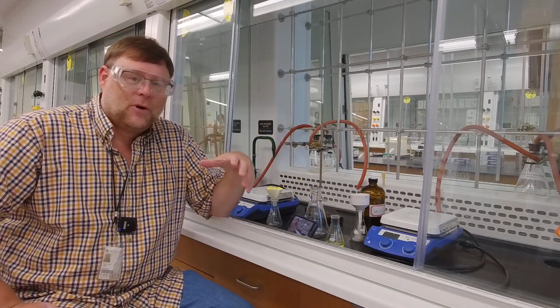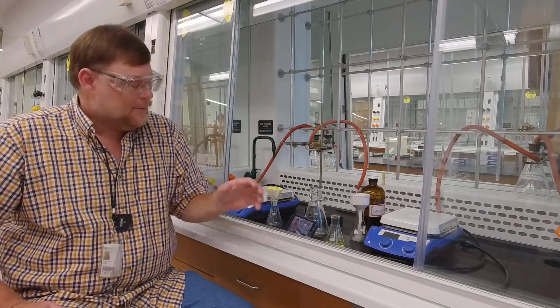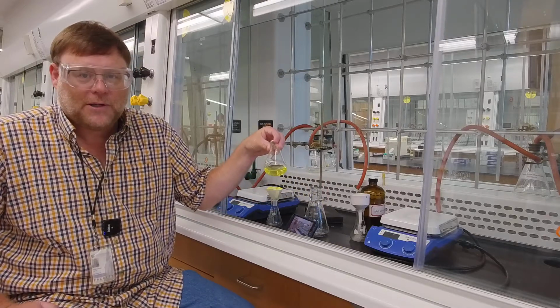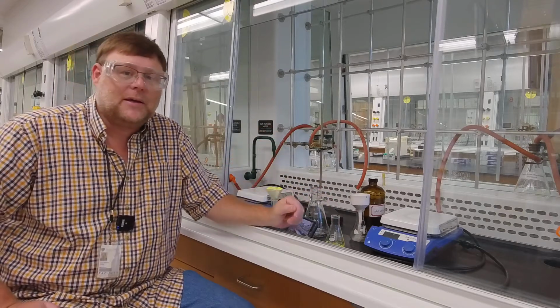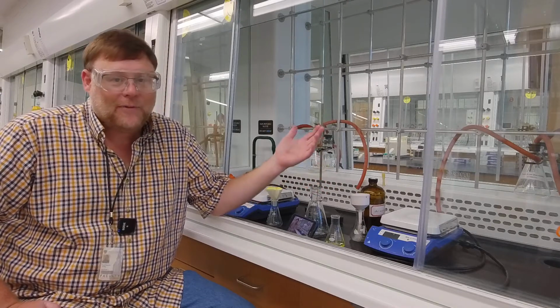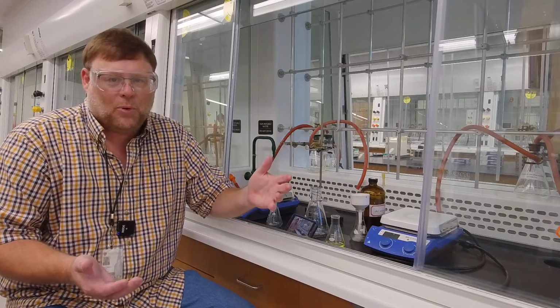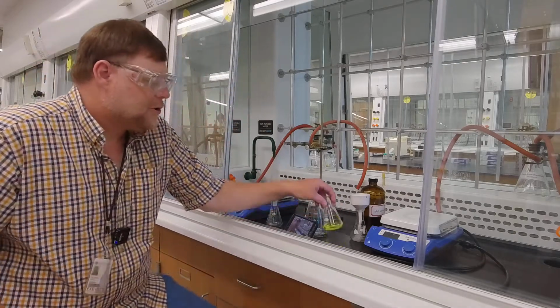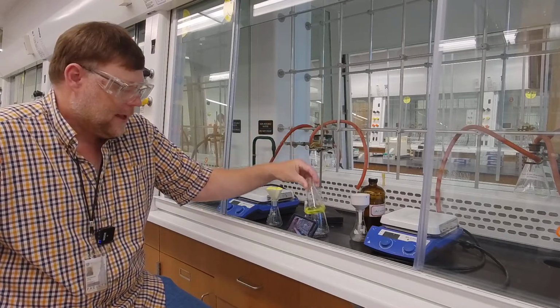You can't use a rotovap if the thing you want to isolate boils at a low temperature, right? So if the solvent here, as we got this solution from the filtration video, is ethyl acetate, ethyl acetate boils at about 70 degrees C. So if the thing I want to isolate boils at 85 degrees C, they're close in boiling point. I can't separate them by boiling. All right, so we can't do rotary evaporation with an Erlenmeyer flask.